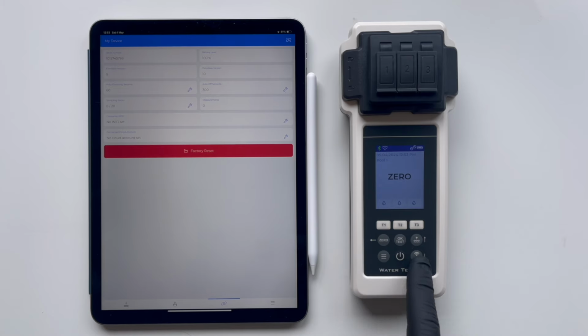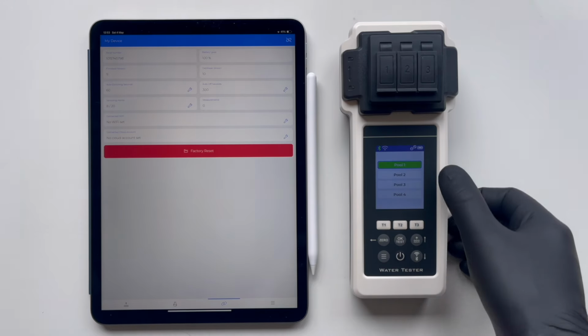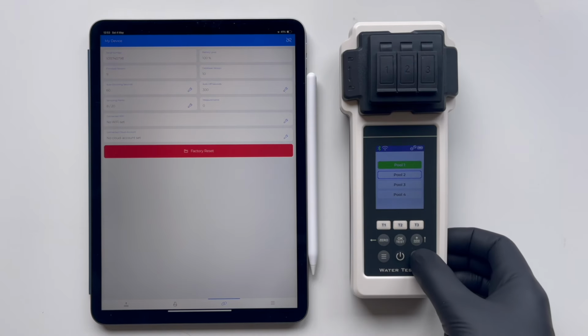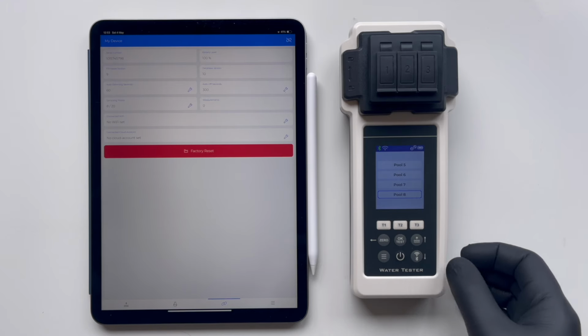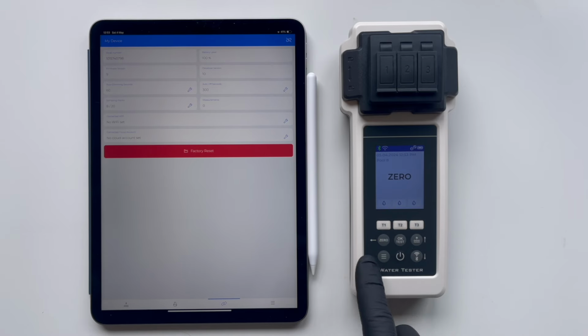Alternatively, you can do this differently. Press the up button on the tester, which provides direct access to the sampling points. Then, choose the point where you will perform the tests. In this case, we select Pool 8. We will immediately conduct tests for the designated sampling point.